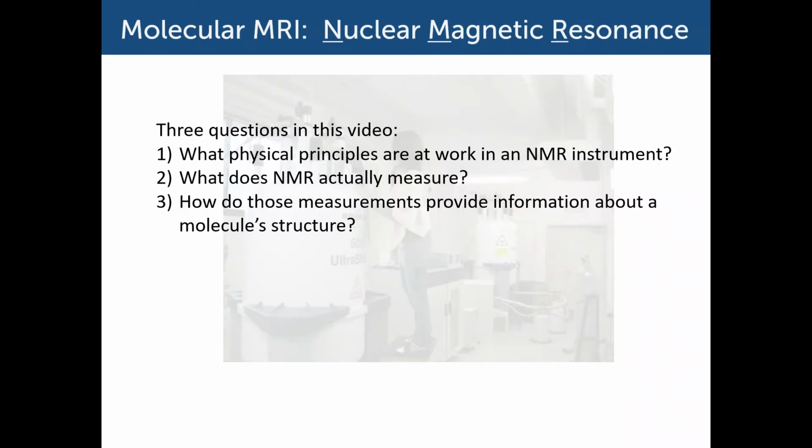And then finally, at the end of the video, we'll start to talk about how we can actually take measurements from NMR to learn something about structure. So think about this video as essentially the groundwork or the framework upon which we will build the rest of our understanding of NMR. So to get started, we'll think about the physics.